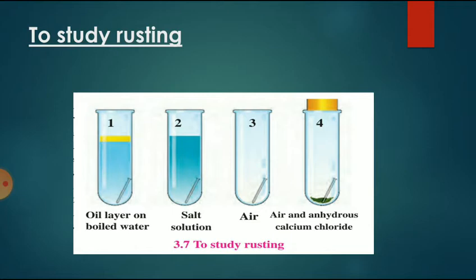Keep these 4 test tubes for a few days. Now observe what exactly takes place in these test tubes after a few days.